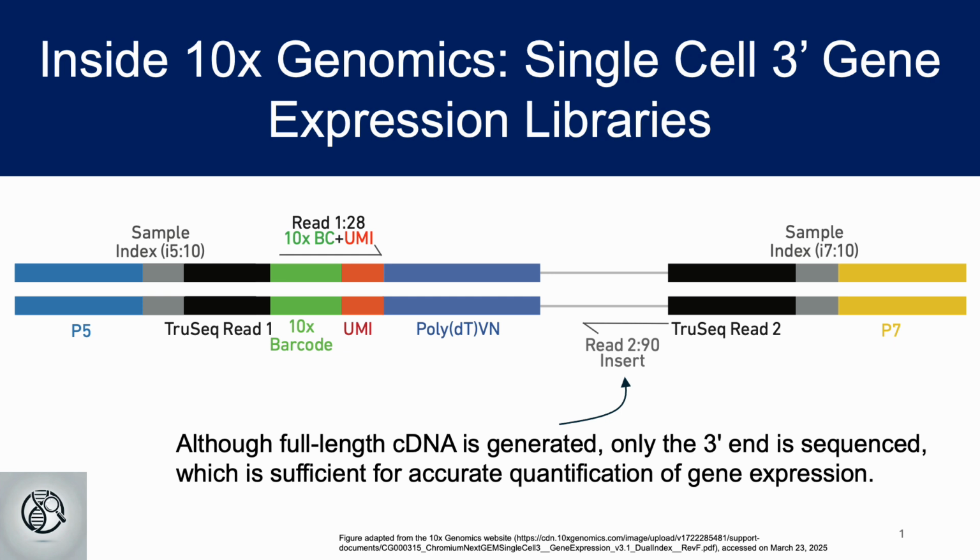Today's video is the first in a series called Inside 10x Genomics, where I'll be breaking down key concepts behind 10x Genomics technologies. As many of you know, 10x has been a leading pioneer in the field of single-cell technologies, and I truly think what they have developed is incredibly cool. So be sure to stay tuned for future videos as well. Today, I'll be diving into how single-cell 3' gene expression libraries are made.